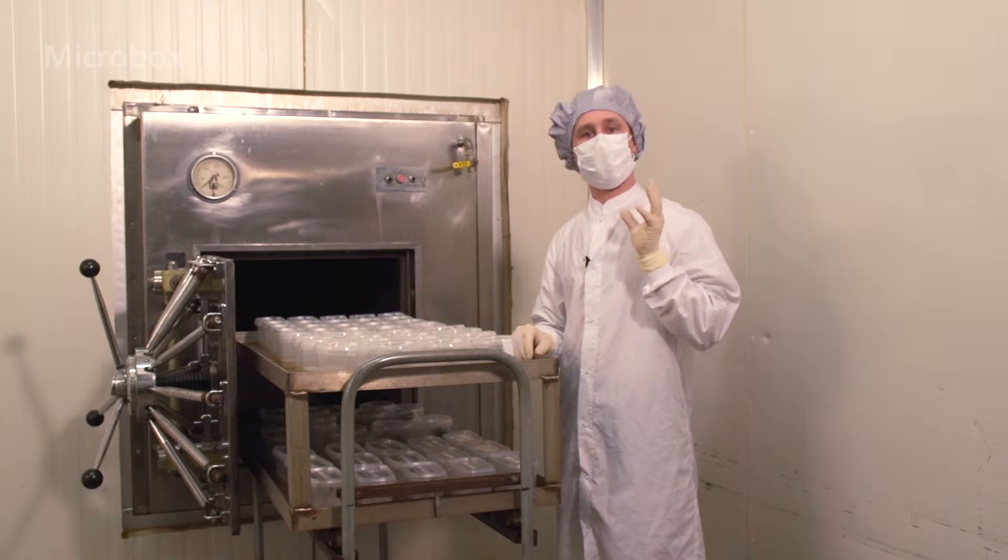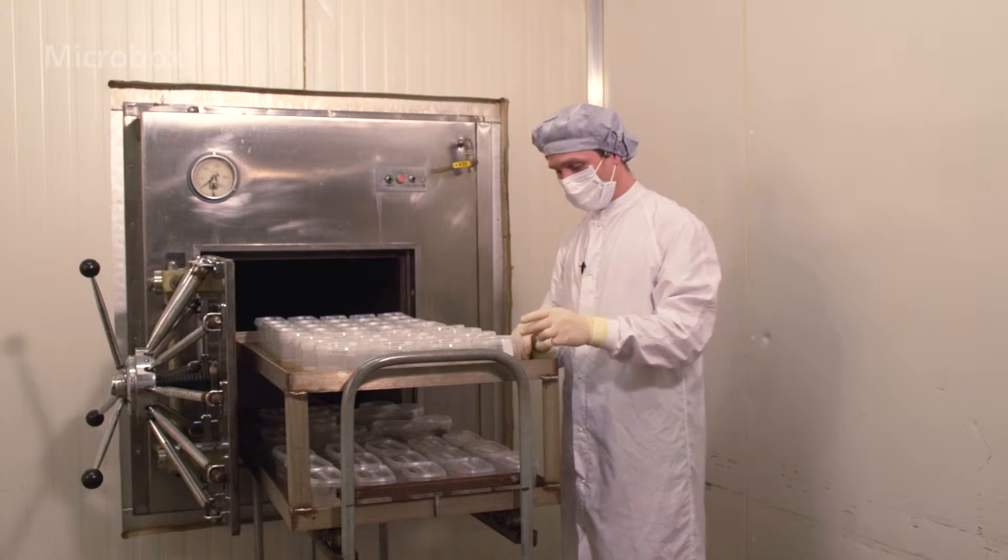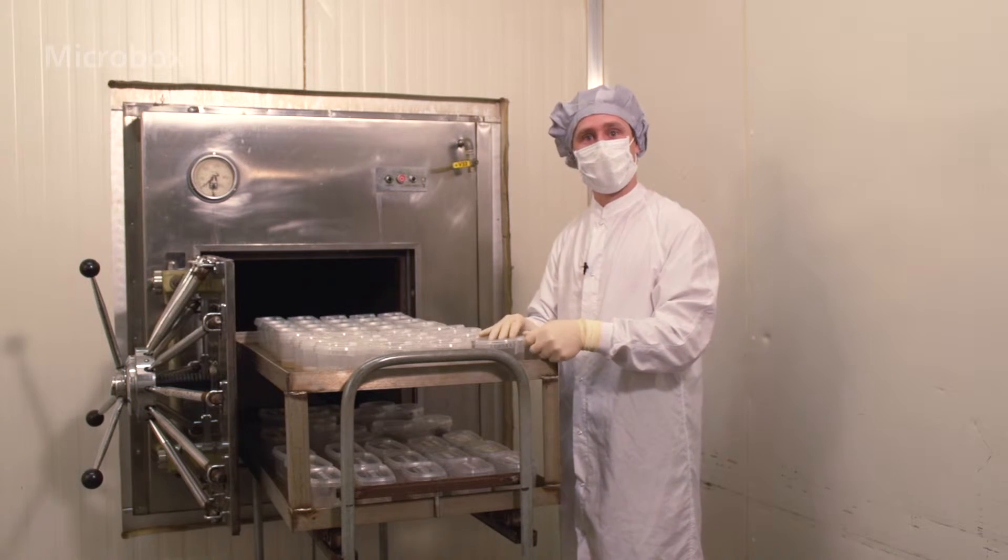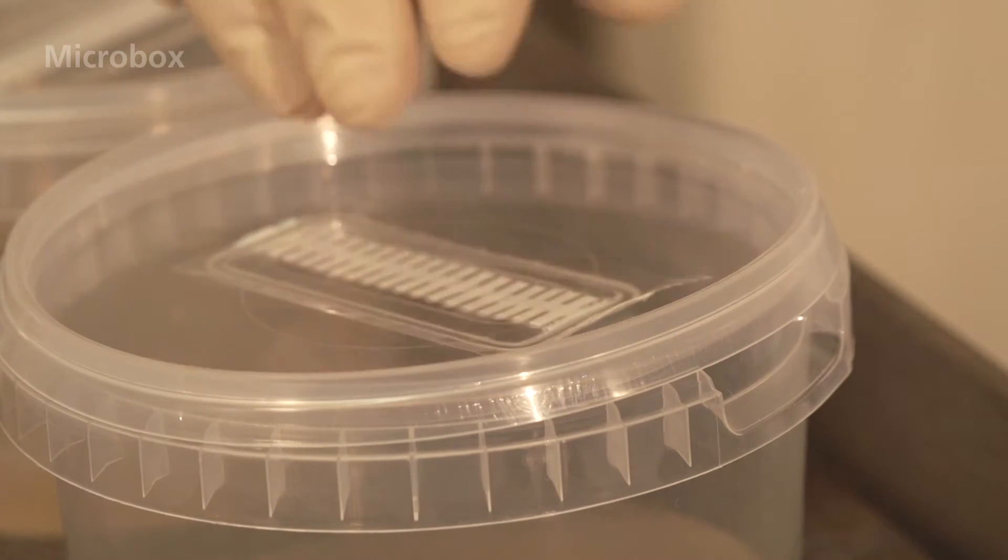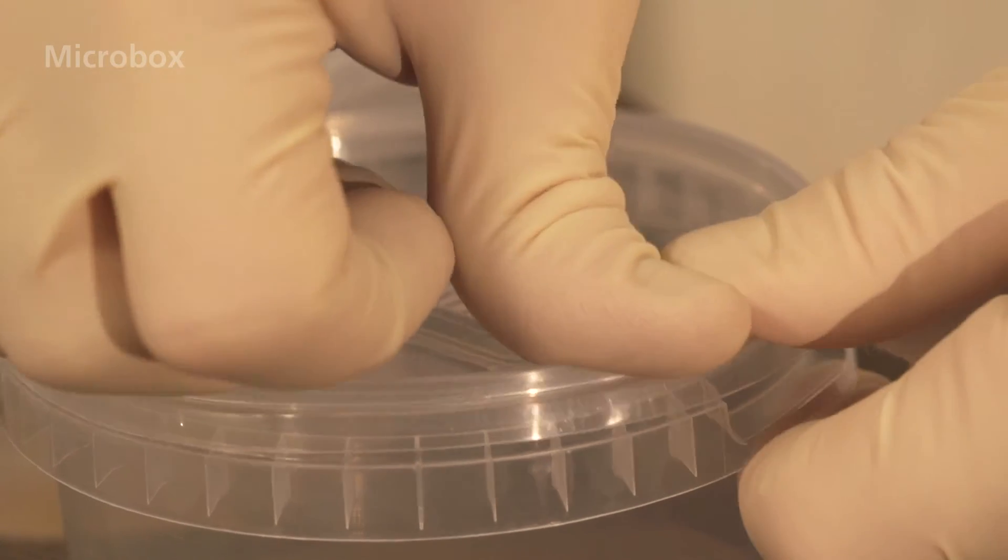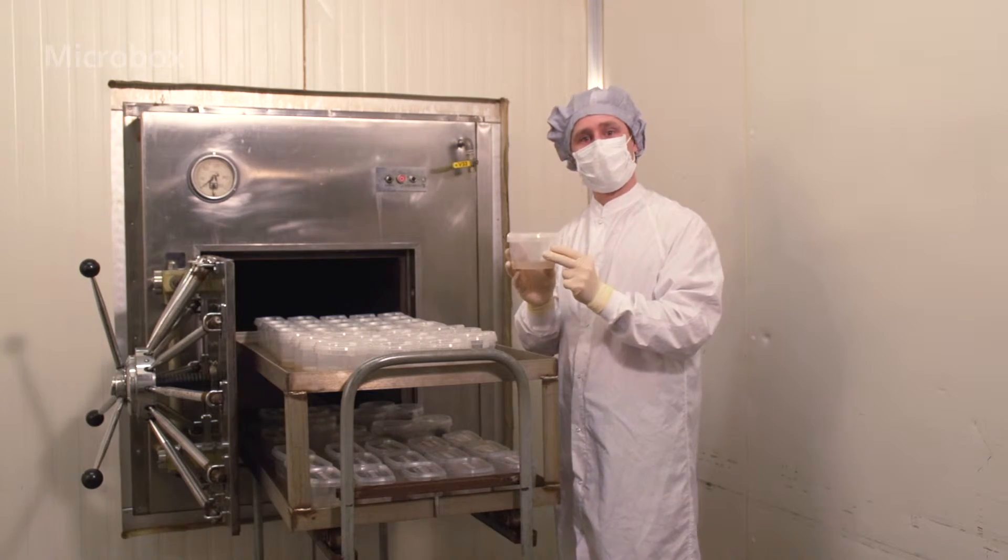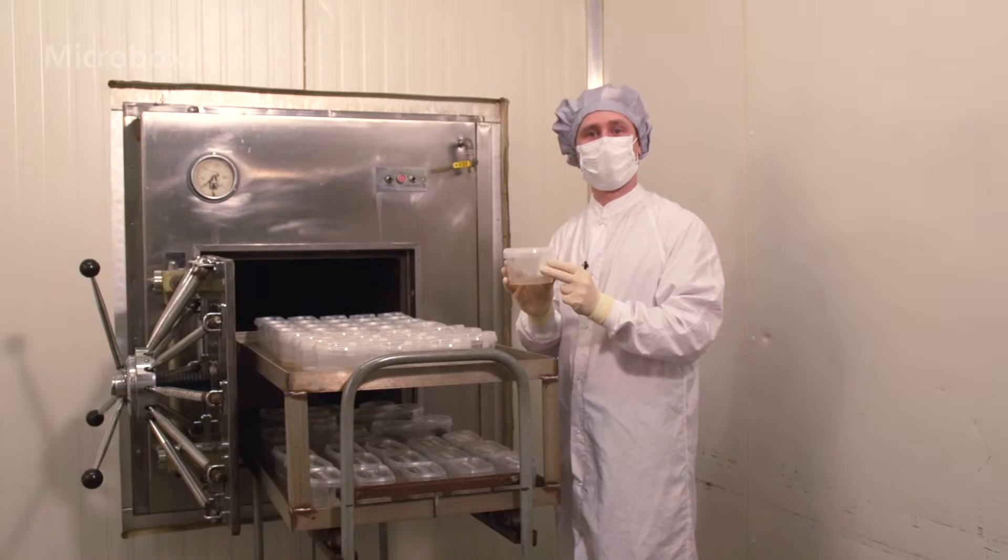When taking the micro boxes from the autoclave, remove the piece of non-woven fabric immediately and close the box firmly. The micro box is now ready to be stored in your cleanroom department.